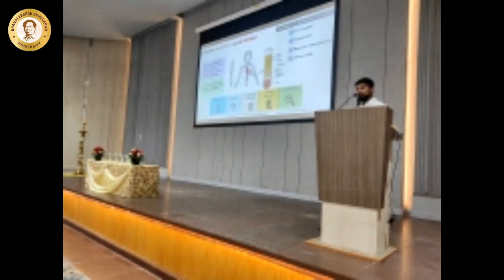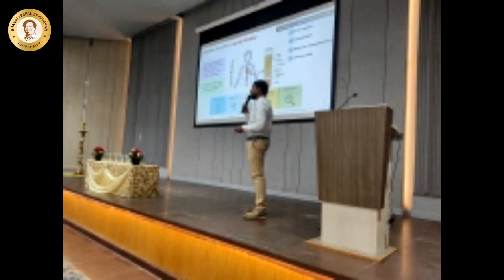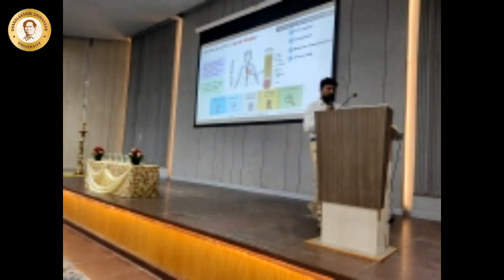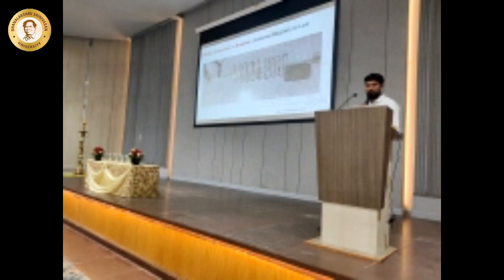So people have been talking about circulating tumor cells. SPIONs have been used. We use a lot of different diagnosis techniques, and we generate microfluidic devices. And I'll show you one good video.